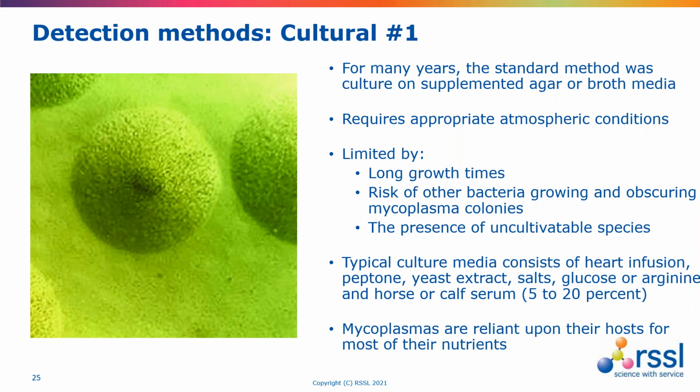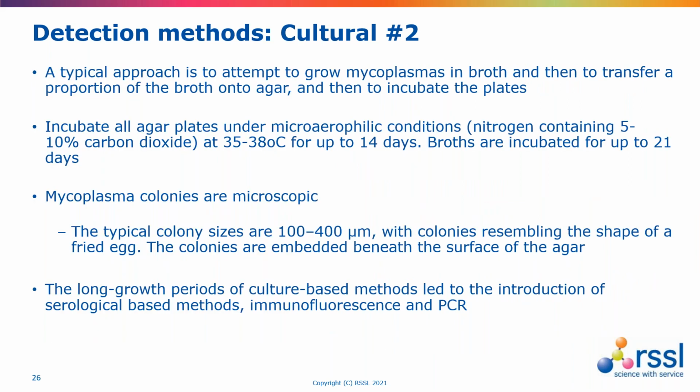So it's important that a rigorous quality control scheme is in place to verify the suitability of the media before it's used. And the typical testing approach would be to attempt to grow mycoplasma in broth and then transfer a proportion of the broth onto agar and then to incubate the plates. And again, as I mentioned earlier, mycoplasma growth in terms of colony formation is microscopic. So this contrasts to the macroscopic cultures that we would typically see from other bacteria following a suitable incubation time.